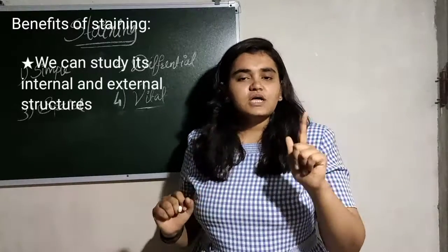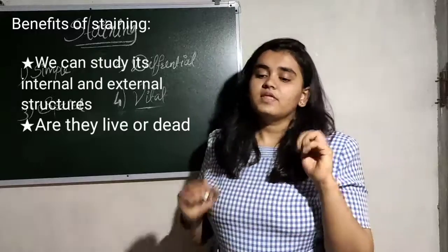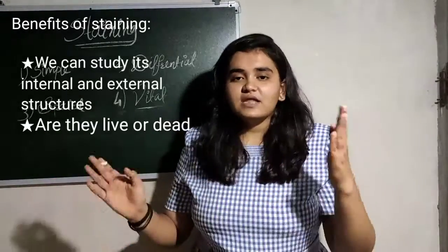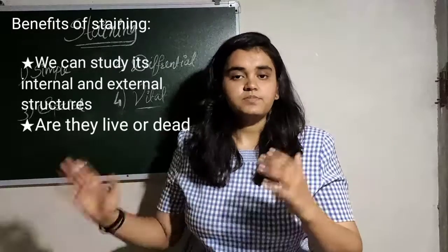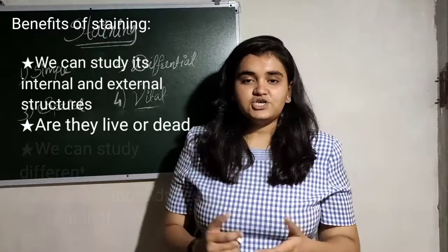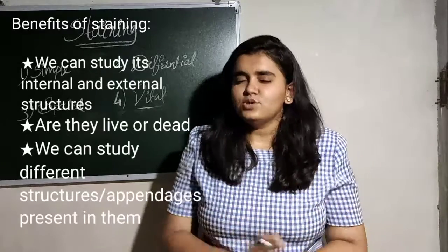Next thing, we can come to know its internal as well as external structures. And we can also come to know whether they are live or dead. If they are dead, they will react in different ways. If they are live, they will react in their obvious manner. We can even come to know about its motility structures, appendages, and so on.